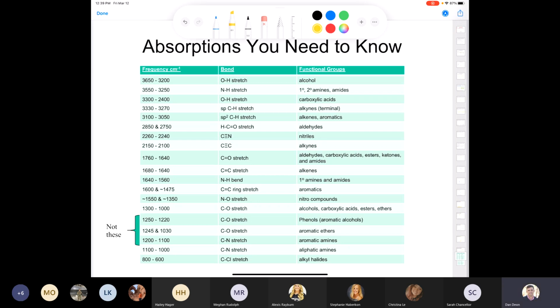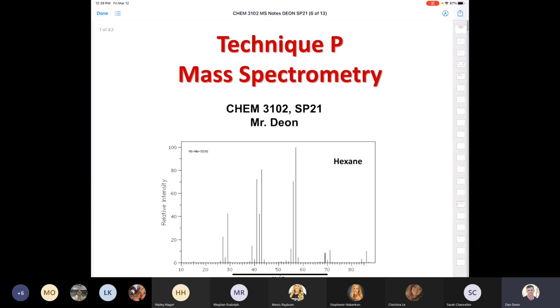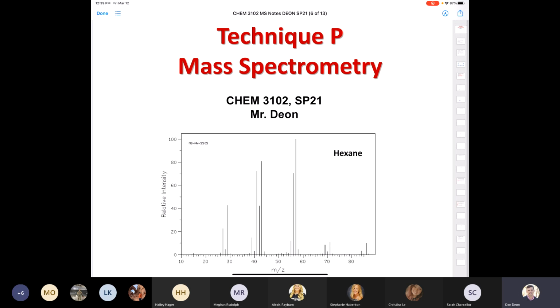Okay, well, with that in mind, now we're going to turn our attention in the next 4 hours. We're going to look over mass spec, and I'm going to spend the rest of the lecture going over mass spec because in the lecture course, David Klein doesn't go into that much detail about the mass spectrometry of different functional groups, and that's kind of the treatment that I want to give it in this lecture.